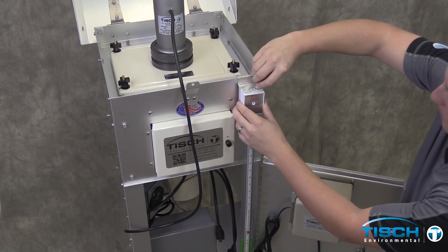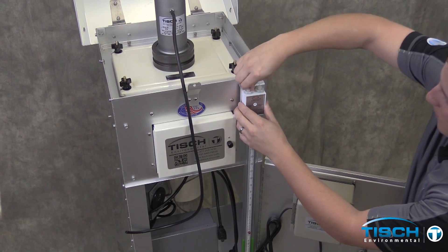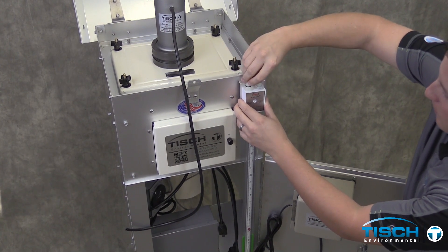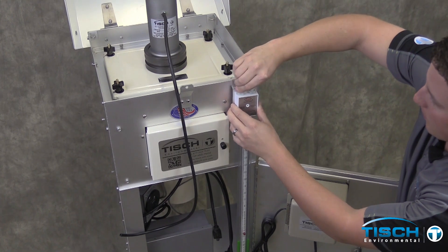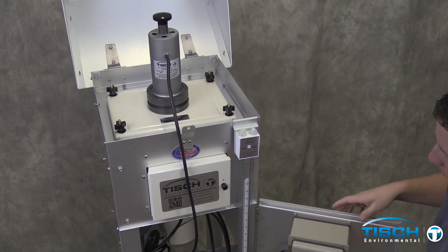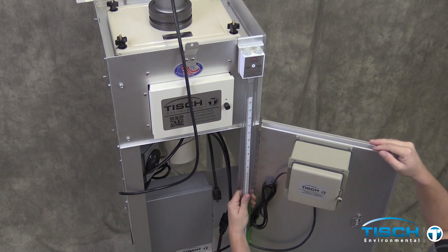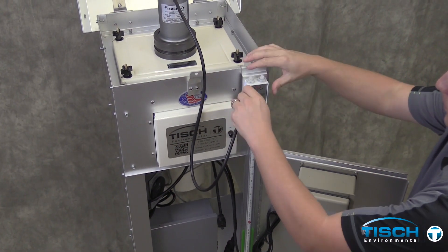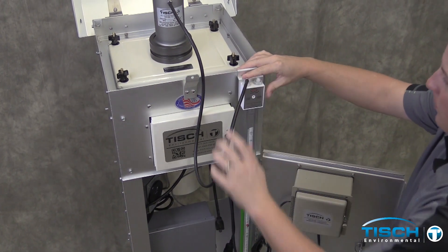Loosen the valves up on the water manometer. Take the valve completely off and then screw it on with one thread. Do this to both of them. One valve is going to be connected to the black piece of tubing and the other valve is going to be open to the atmosphere. Zero the manometer. Connect the black piece of tubing to the manometer.